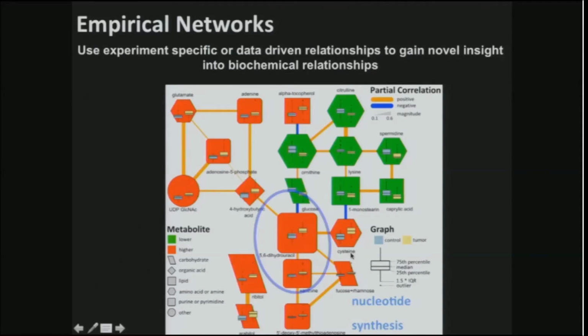And so we can look at it, and we see that it's actually reporting on nucleotide synthesis. So we actually have 3 different markers of different nucleotides going up. So in cancer, DNA synthesis is up, nucleotide synthesis is up. So next, we can look at some of our amino acids. Look at this cluster, they all have the same shape. And so we see that the increase in nucleotides is negatively correlated to a decrease in amino acids, and specifically 2 urea cycle species. And it's converted through glucose, whatever that might mean.